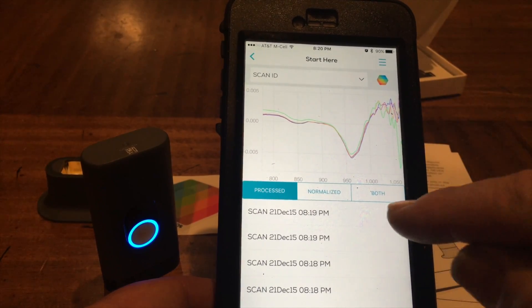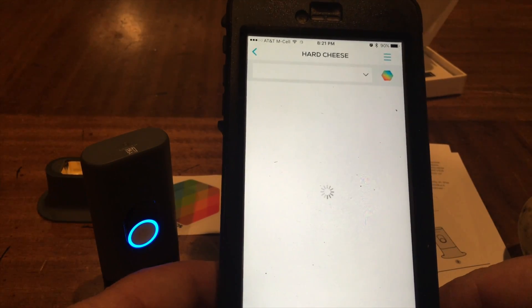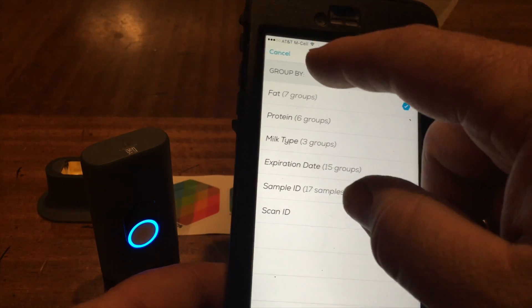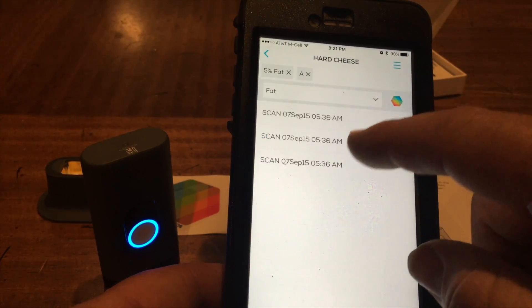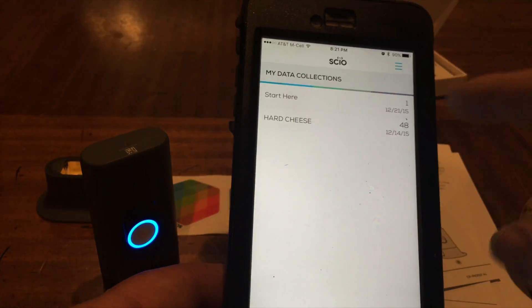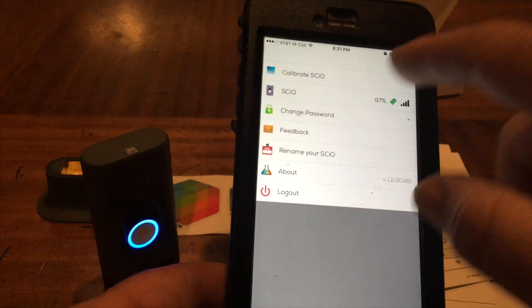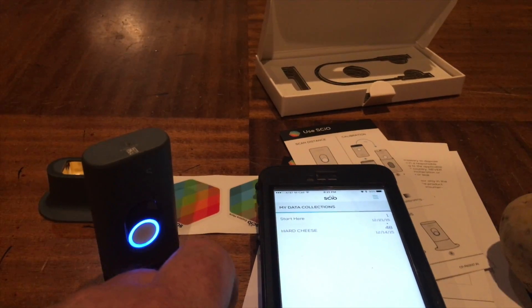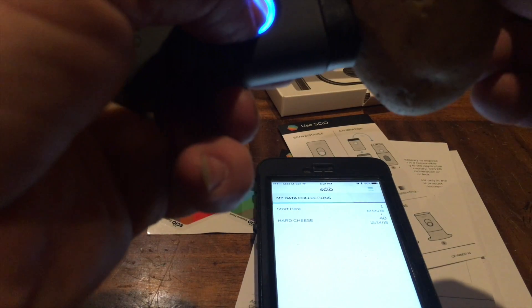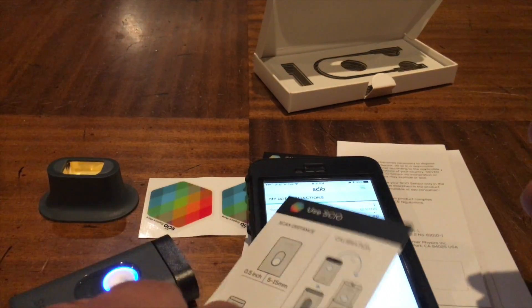I don't know much about what this means, so I'm going to have to do a lot of research. Brand A - I wonder if I just go up and scan this, will it tell me anything about it? Alright - doesn't do that, so more reading must be necessary.